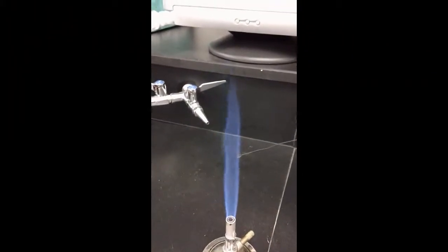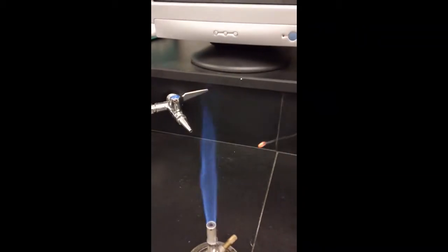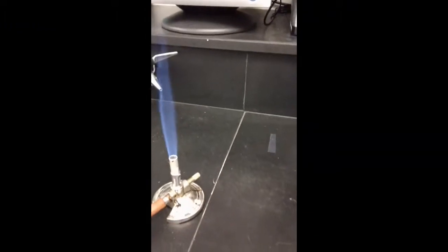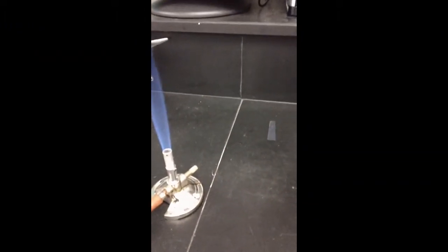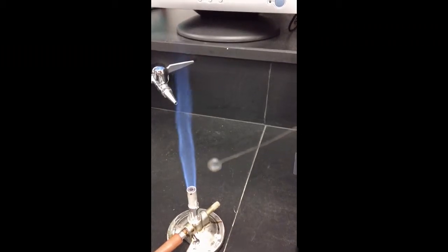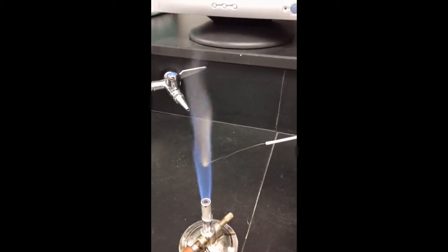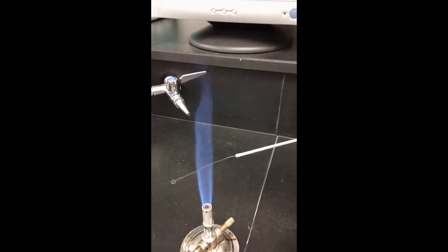K. Put the test rod in there. Make sure we have our loop full. Oh, notice that we have some sparks and some green. So again, I'll do it one more time. Full thing, pay close attention. This is K for test A. Okay.